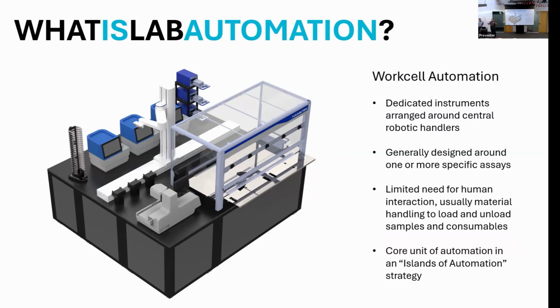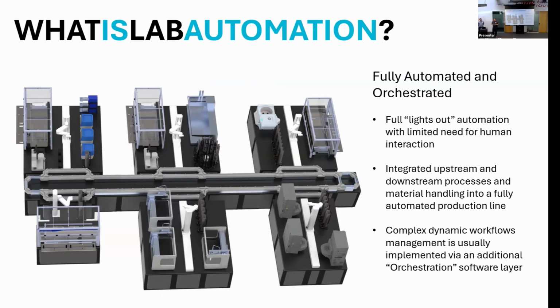And so again, though, this is targeted at usually assay level work and trying to solve a particular problem within the lab, one or more assays that you can dedicate this hardware to. And the later stage within that system is this more production level, fully automated and orchestrated systems that you would see.